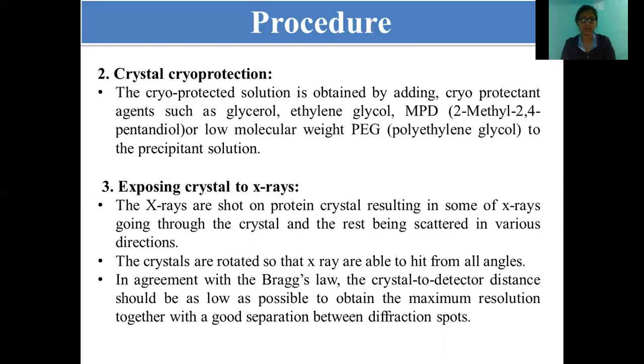Before going to the third step, an important step is crystal cryoprotection. This is an important point. Why is there a necessity to do crystal cryoprotection using certain chemicals like glycerol, ethylene glycol, or MPD, that is methylpentanediol?